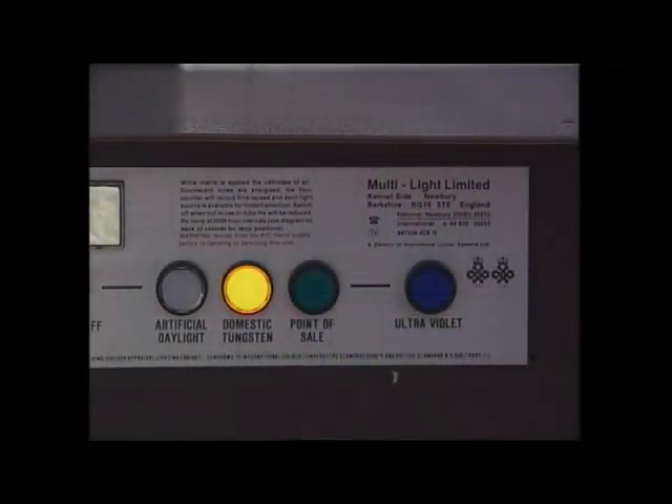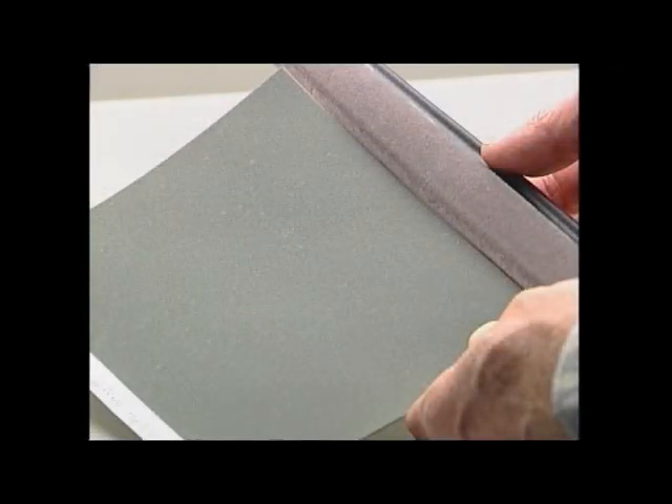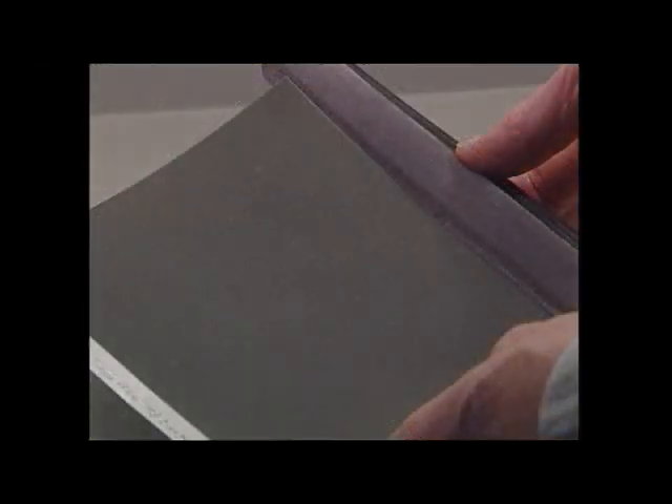The car industry especially requires extremely high light fastness characteristics. The light exposure device simulates the influence of sun rays over years within just a few days. And in special colour testing cabins, the different light sources highlight the smallest possible colour differences in the Flock surfaces.